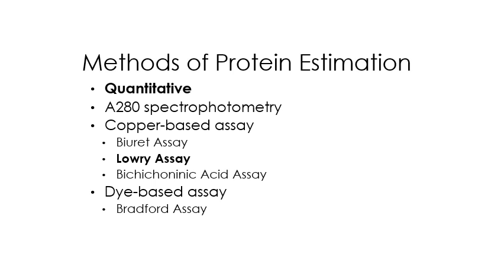As I mentioned before, we also have other methods that can estimate protein content. These methods allow you to quantify the protein content by absorbance. There are many of these methods. They may have different principles, but what you're going to measure is the absorbance.